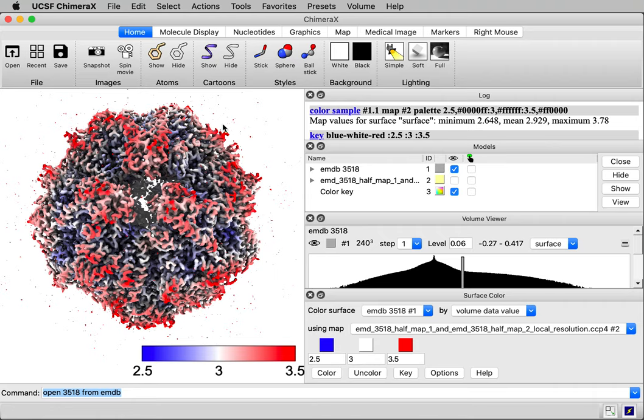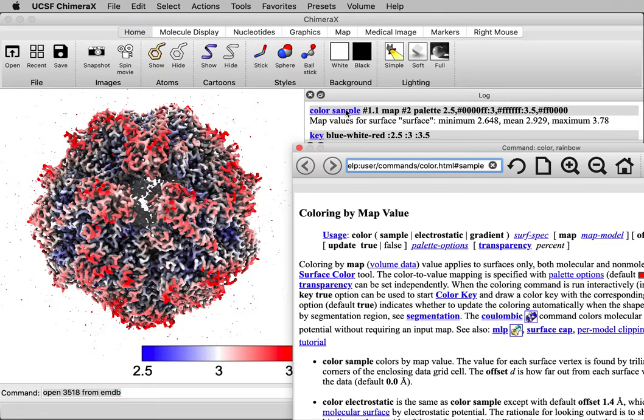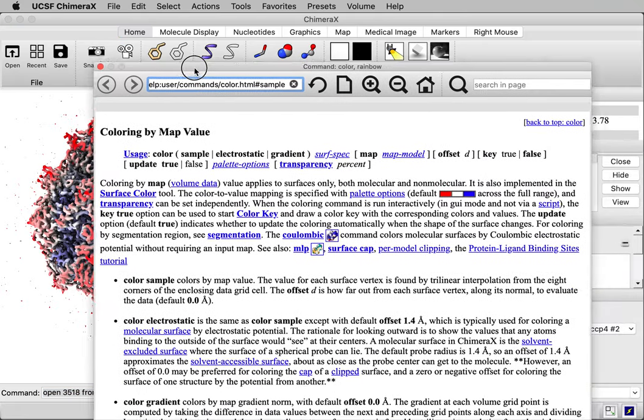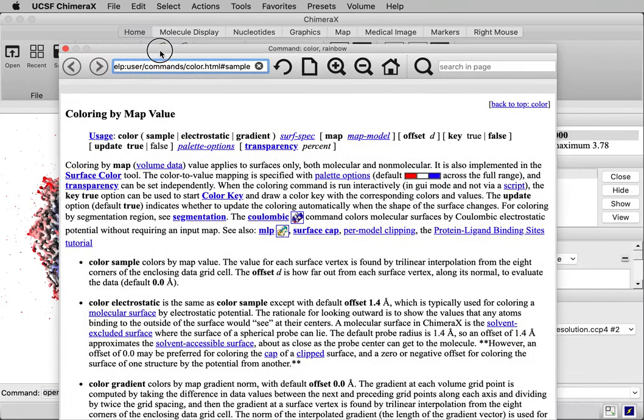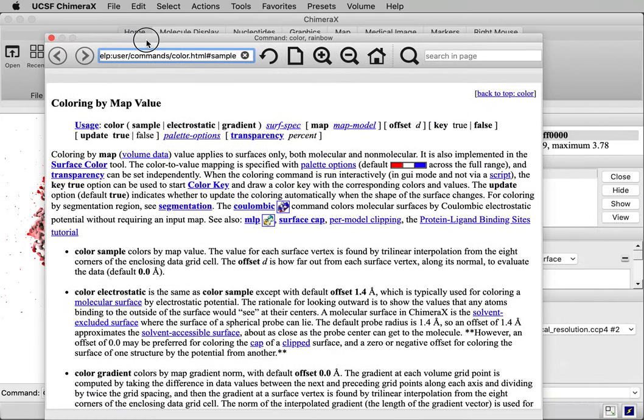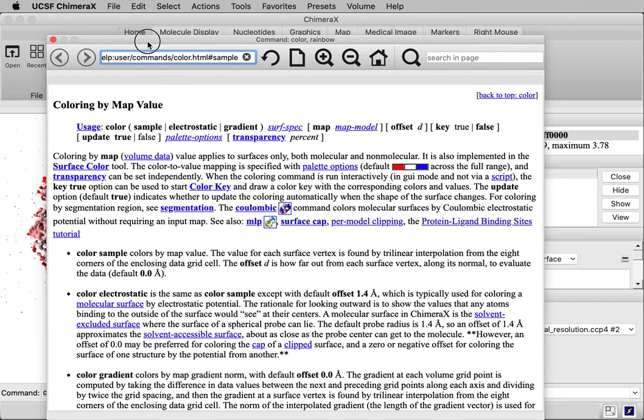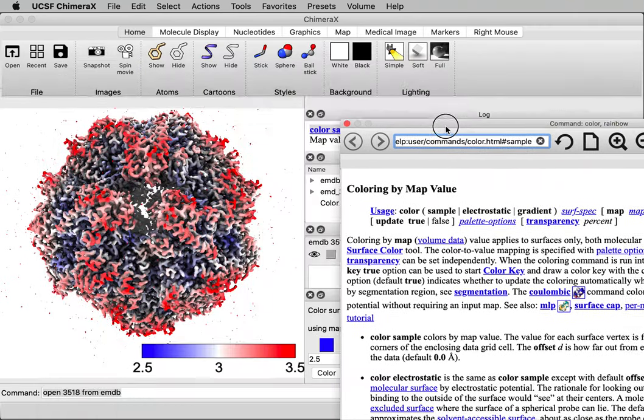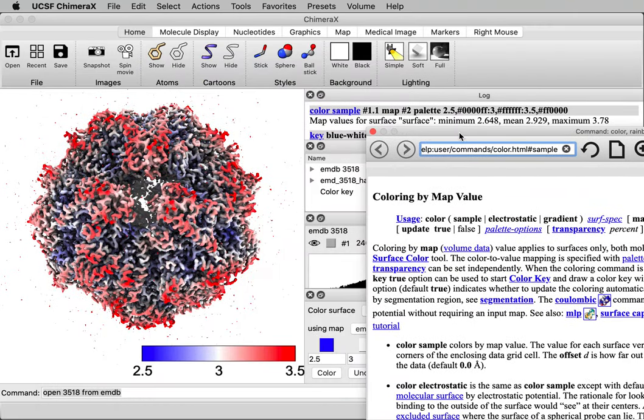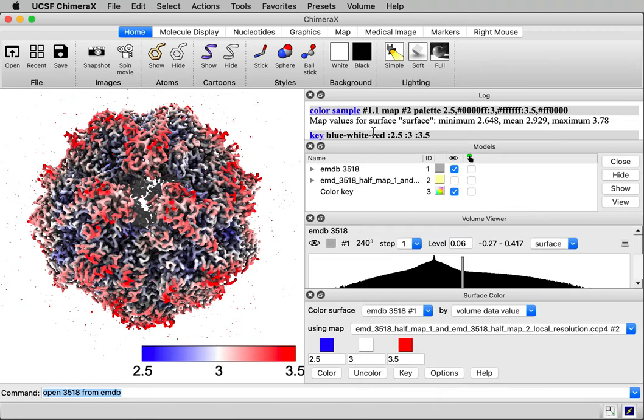If I click this link color sample, it will give me documentation. All of those links in the log bring up documentation, so detailed documentation on the command. Let's do the coloring by command just so you can see what that looks like.